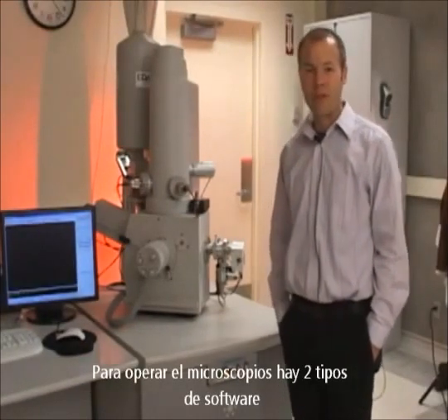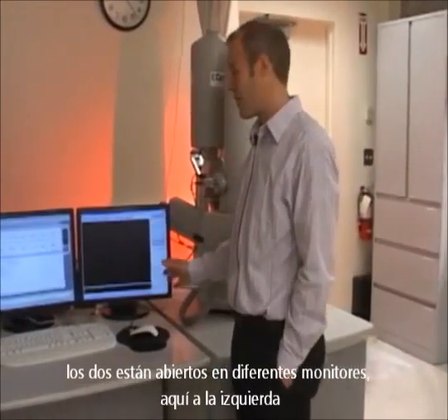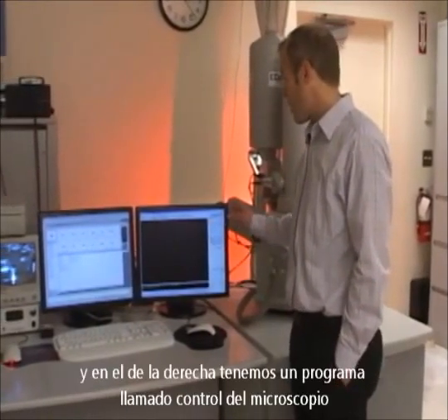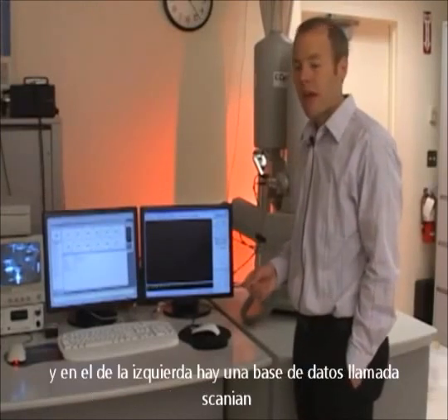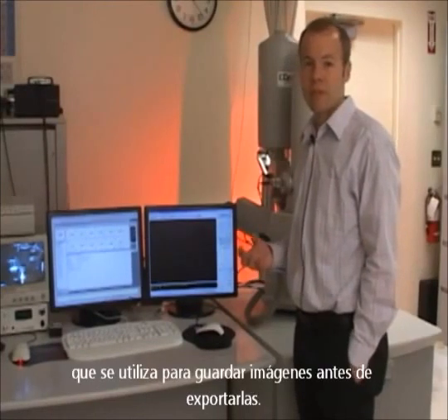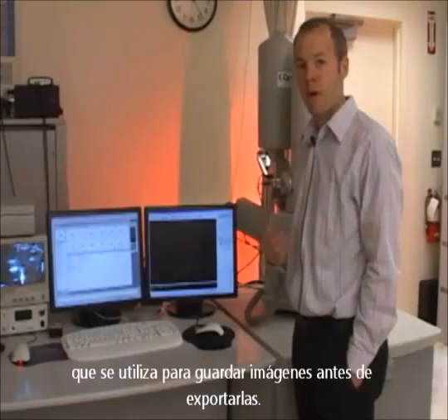To operate the microscope there are two pieces of software, both run from the same CPU. You'll see both are open on two different monitors over here on the left. On the right-hand monitor we have a program called Microscope Control, which is used for all the adjustments on the microscope. On the left-hand monitor is a database called Scandium, which we use to store the images before we export them for our own use.